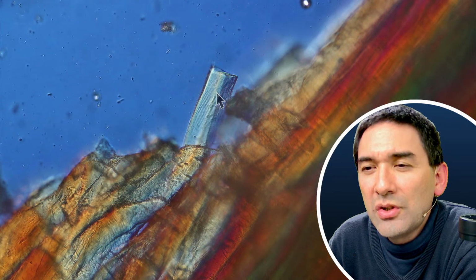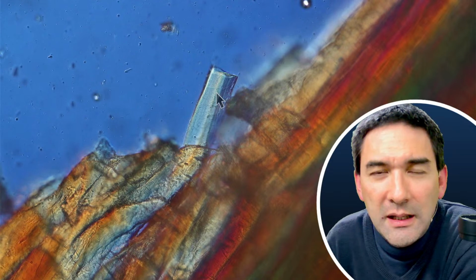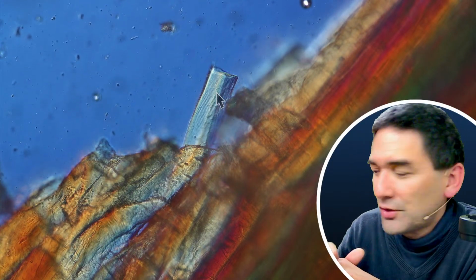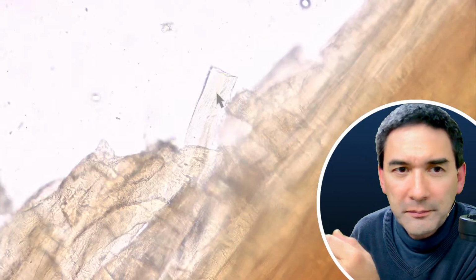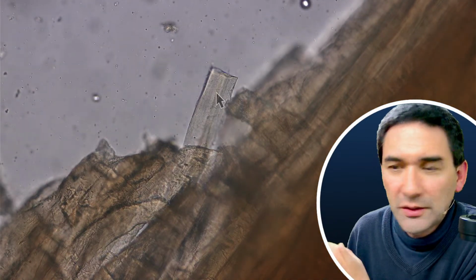What lighting are you using to view the samples? DIC. This is basically DIC, but DIC does use polarized light. But I'm not using cross-polarized filters, right? So that's why you see the background, the blue is blue. This here is now regular bright field. So these are now the natural colors.